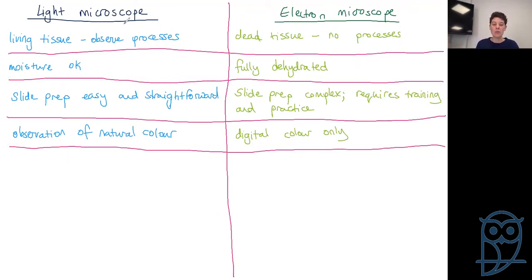Okay, so a light microscope, we're really getting a better idea of what is really going on, what's really there. Electron microscope, we can get that detail, but we don't know what color it is. For all we know, the inside of a cell membrane could be neon pink. But it's unlikely because I do know things about pigment molecules and such like that they can get proper ideas of what colors are. But it's that concept of an electron microscope, when you're looking at a micrograph, it's all false color. It's all something that has been digitally altered by a human, rather than when you're looking down a light microscope and you can actually see what the color is of what you're observing.